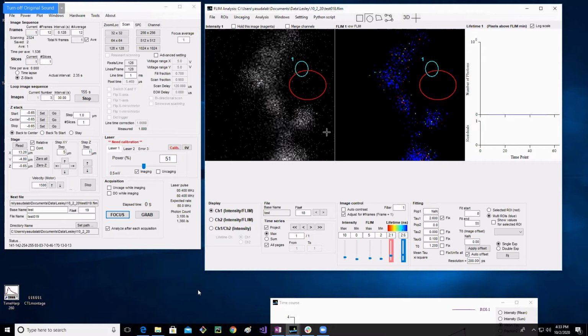So for us, having a lower resolution image isn't, for most things, really crucial. But unless someone tells you otherwise, you should be using 128 by 128. A lot of people use 2 milliseconds instead of 1 millisecond. I just use 1 millisecond. So whatever is set on your microscope or what your mentor wants.